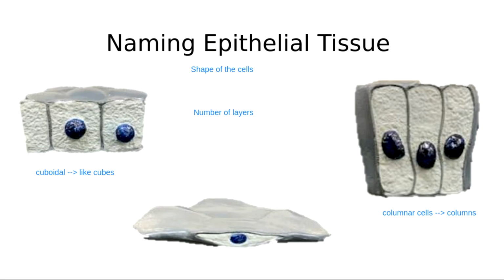They're going to be really flat, maybe a little bit circular if you're looking at them from the top, but they're flat. So the squished flat cells, that's my squamous cells. My just as wide as they are tall cells, that's the cuboidal cells. And my much taller than I am wide cells are called columnar cells.